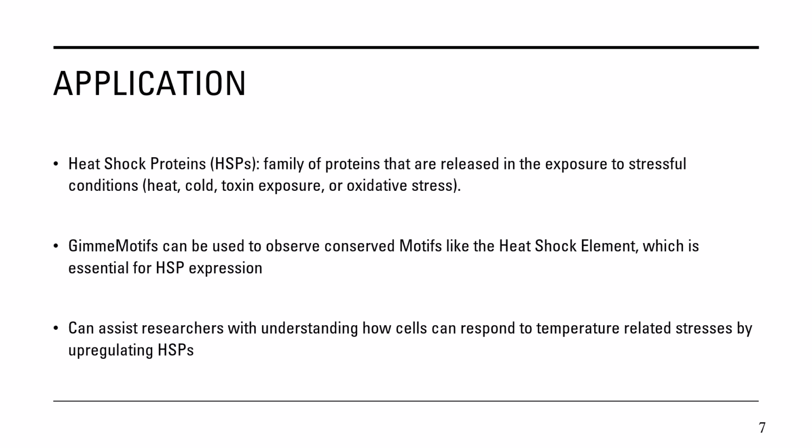And so where GimmeMotifs can be used is to observe some of the conserved motif structures within these mRNA sequences, such as the heat shock element, which is essential for looking at HSP expression. This can further assist researchers in understanding better how certain cells can respond to temperature-related stresses by the upregulation of HSPs.